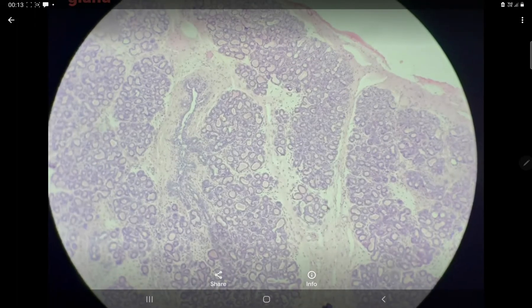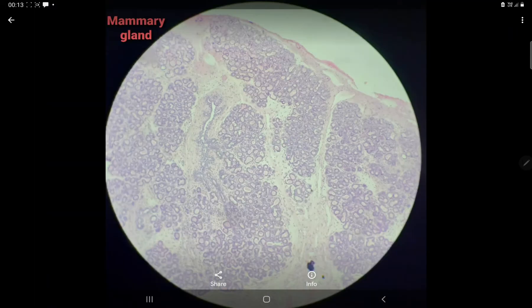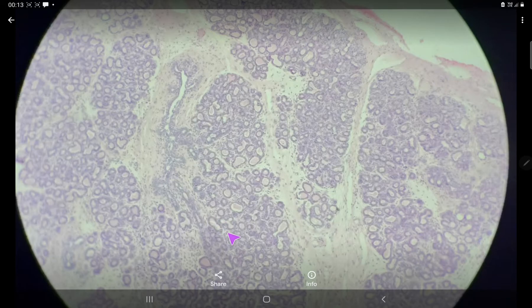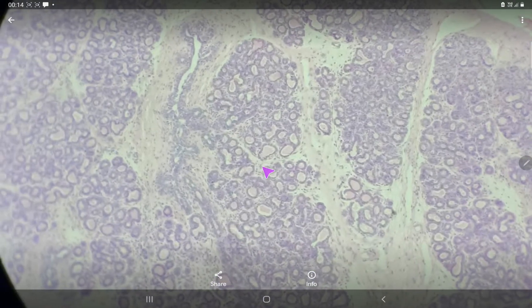The third type of slide is the lactating mammary gland, which is this slide. In the lactating mammary gland, you will find well-developed lobules, lobes, and duct system, where you will find alveoli of various size and shape, and these alveoli are filled with some secretion.